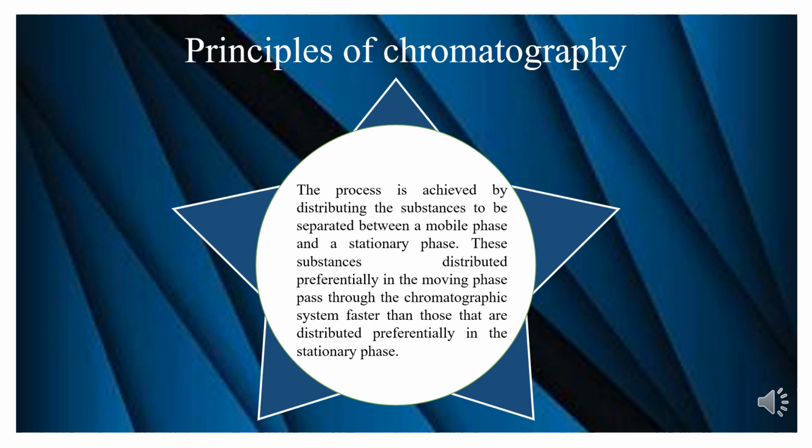As the mobile phase continues to travel through the stationary phase, it takes the compounds with it. At different points in the stationary phase, the different components of the compound are going to be adsorbed and are going to stop moving with the mobile phase. This is how the results of any chromatography are gotten: from the point at which the different components of the compound stop moving and separate from the other components.